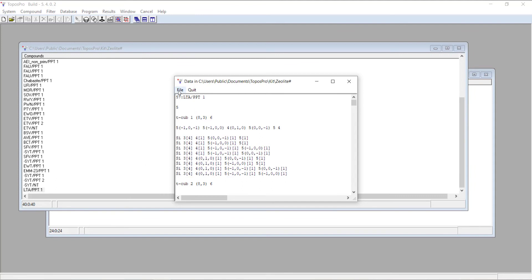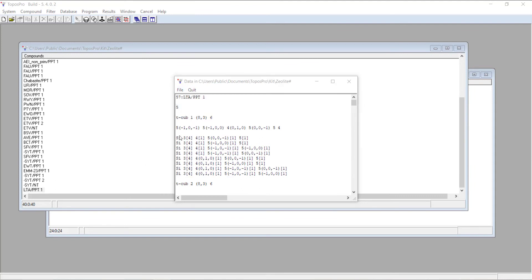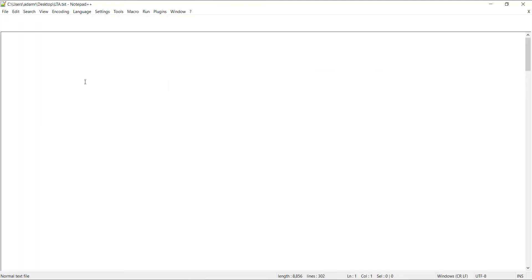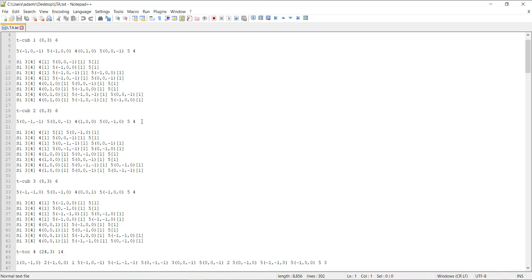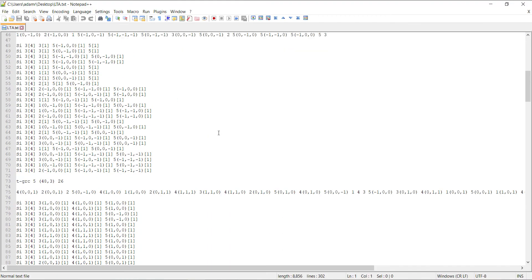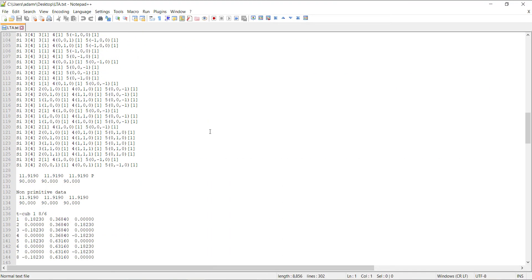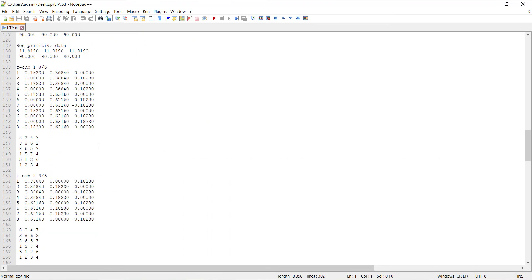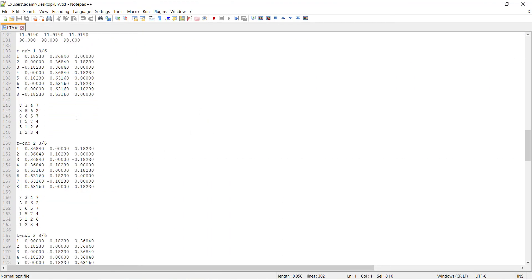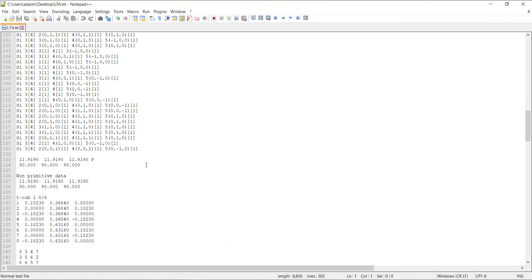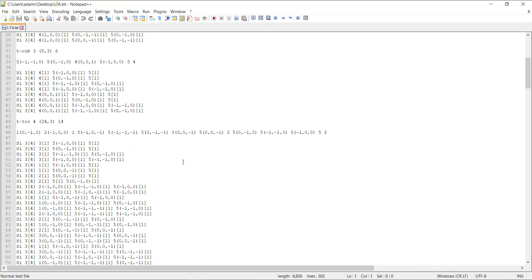You can just press file, save as, and choose a location to save the structure file. I'll just save it on my desktop and call it LTA. If I open that file, you can see it's the same as what was being displayed in Topos. This file can now be used with Crystal Grower to grow an LTA crystal.